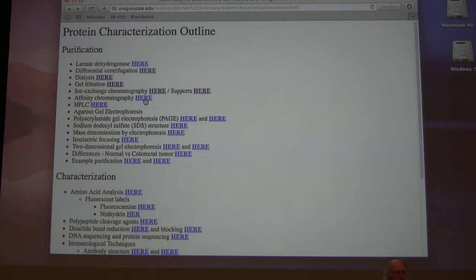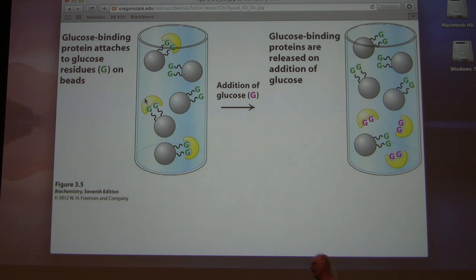Okay, a very cool type of chromatography is known as affinity chromatography. Very useful. It's illustrated here. Affinity chromatography relies on the tendency of certain proteins to bind to certain molecules or structures. All right. To illustrate this a little better, let's imagine that I have a protein that I know binds to ATP, very common in cells. ATP is the energy source in cells, and so many proteins will bind to ATP because they can use it for energy.